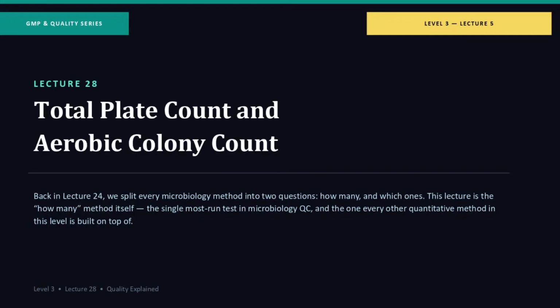Welcome back. This is Lecture 28, Total Plate Count and Aerobic Colony Count. Back in Lecture 24, we split every microbiology method into two questions: how many, and which ones. Today's lecture is the how many method itself. It is the single most run test in microbiology QC, and honestly, it is the method that most of the other quantitative tests in this level are built on top of in one way or another.